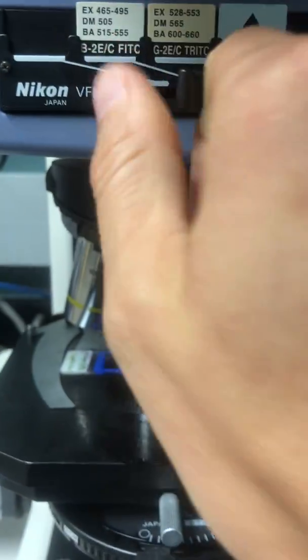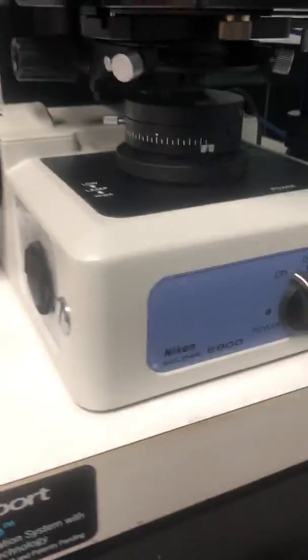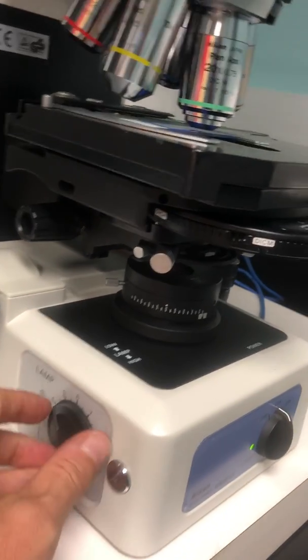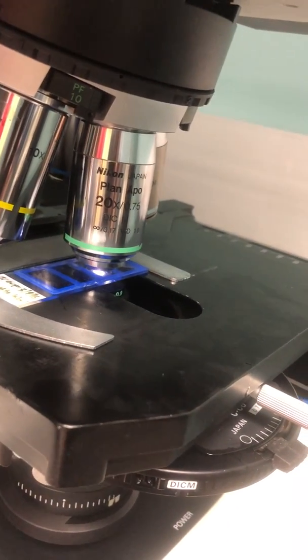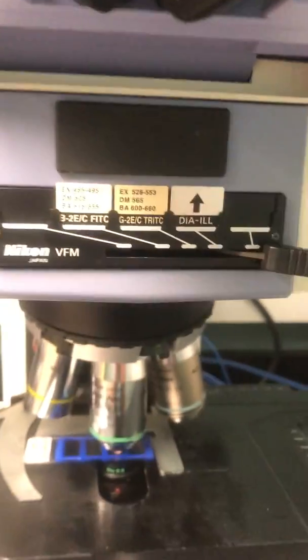Now, for bright light, what you're going to do is turn on this switch here, and then that turns on the bright light lamp. And this switch over here gives you your intensity. So you can see as I turn it to the right, the bright light intensity goes up. As I turn it to the left, the intensity goes down. We're going to want it fairly low, so you probably want to have it somewhere between 4 and 5 to start off with.